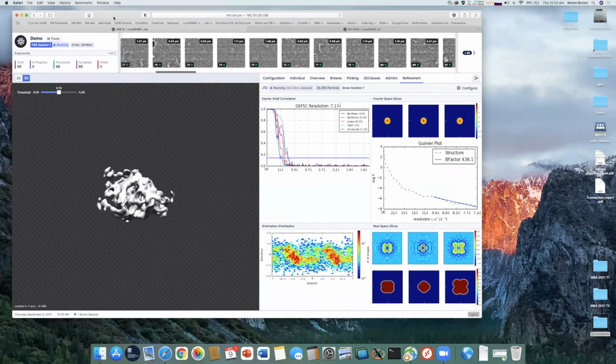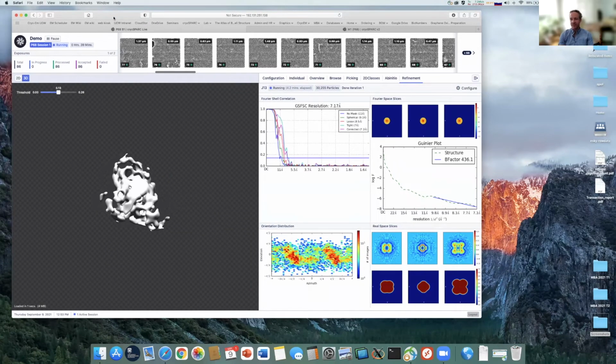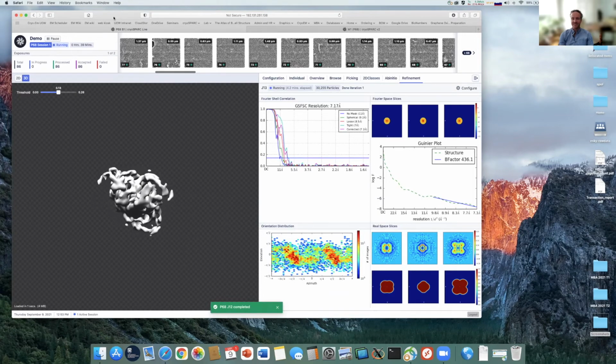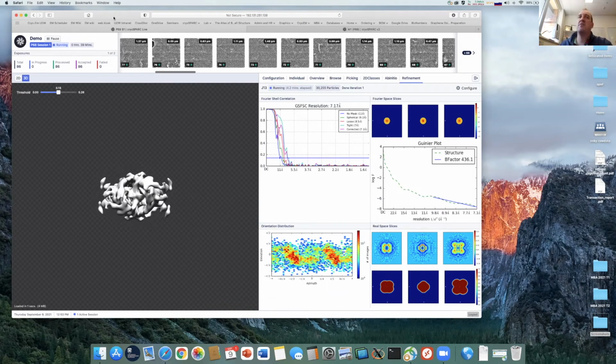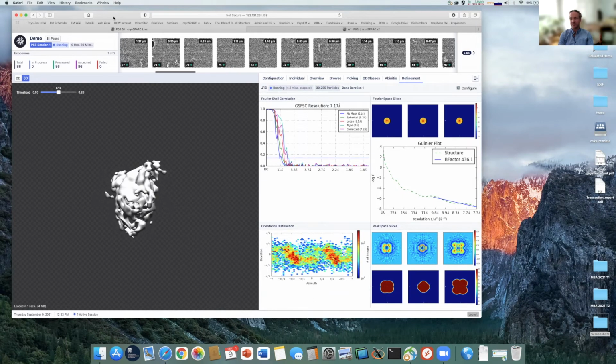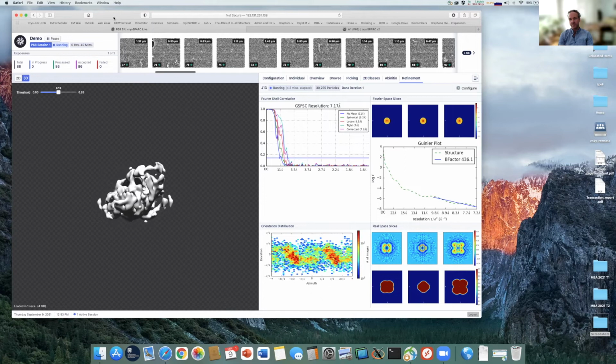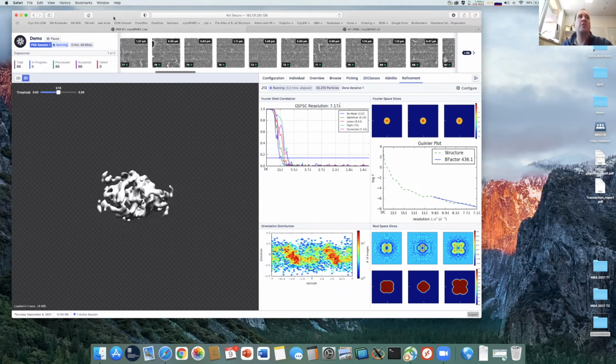So we give another. I have a question if I can jump in. Yeah, please do. Hi, Simon. It's Michael here from UQ. How you going? Oh, good day, Michael. How are you? I'm good. It's not so much about cryoSPARC, obviously, because I'm pretty familiar with it in terms of operation. But you described a number of times there the people that are using the facility and using the software as customers. And so I'm curious how you run things in terms of the restrictions around cryoSPARC and commercial use.